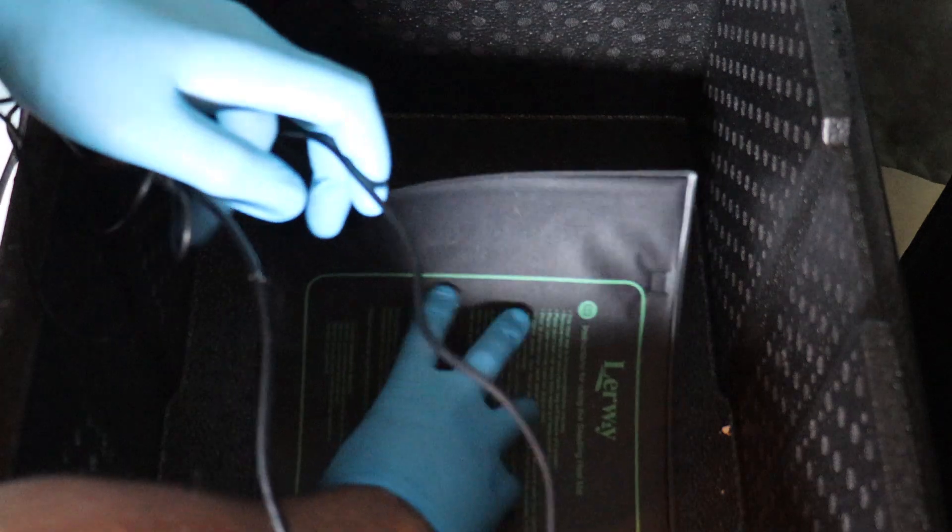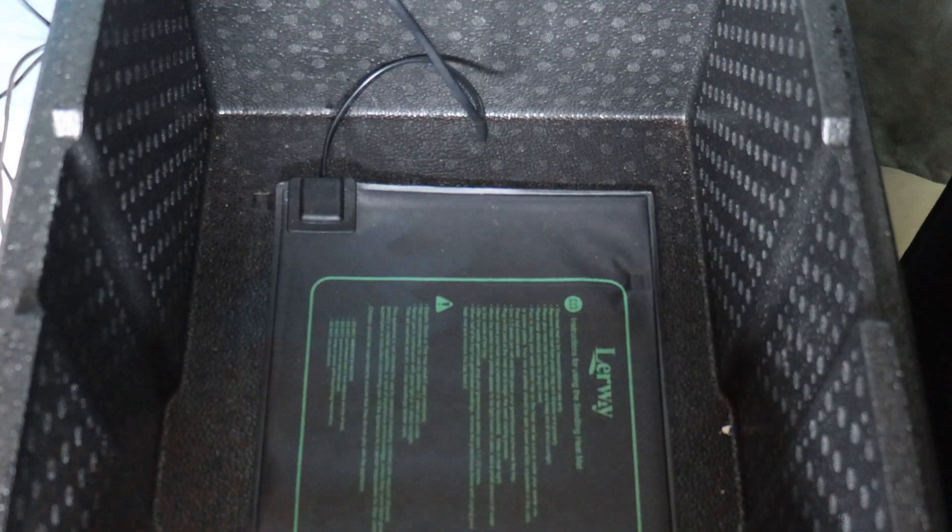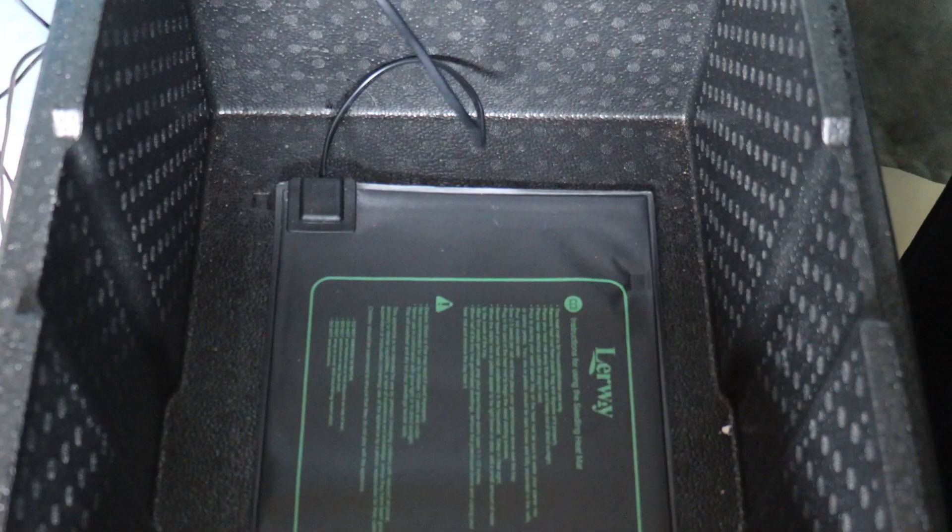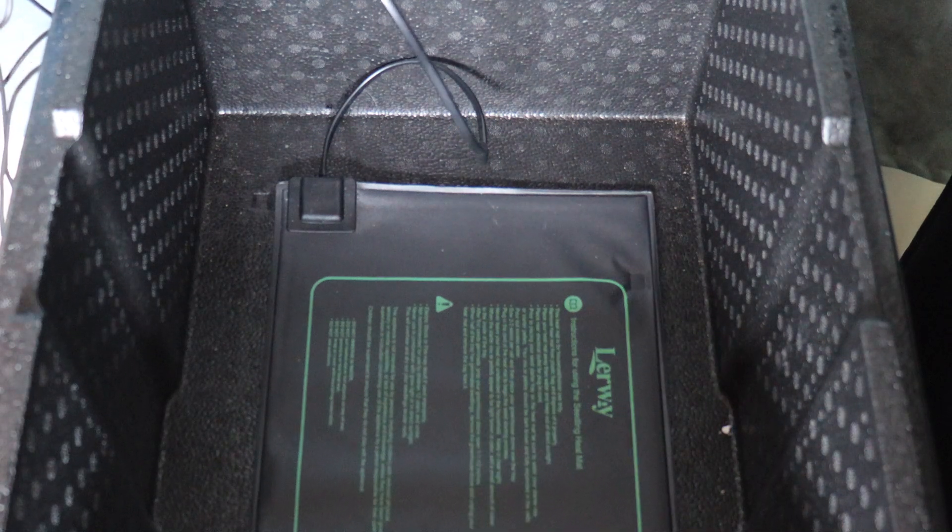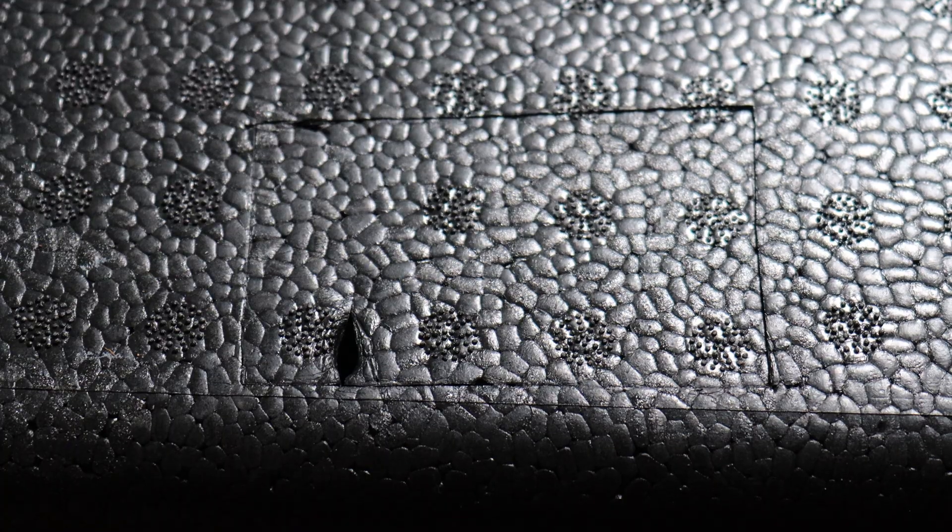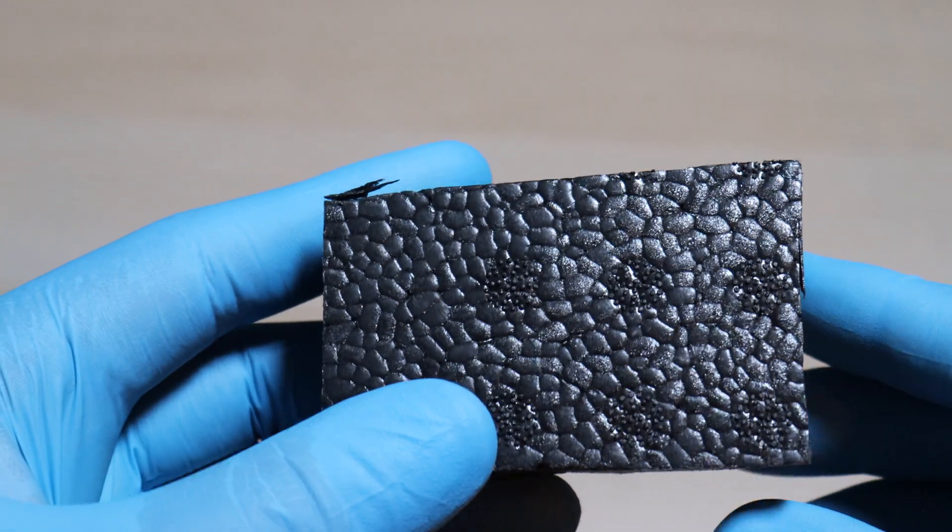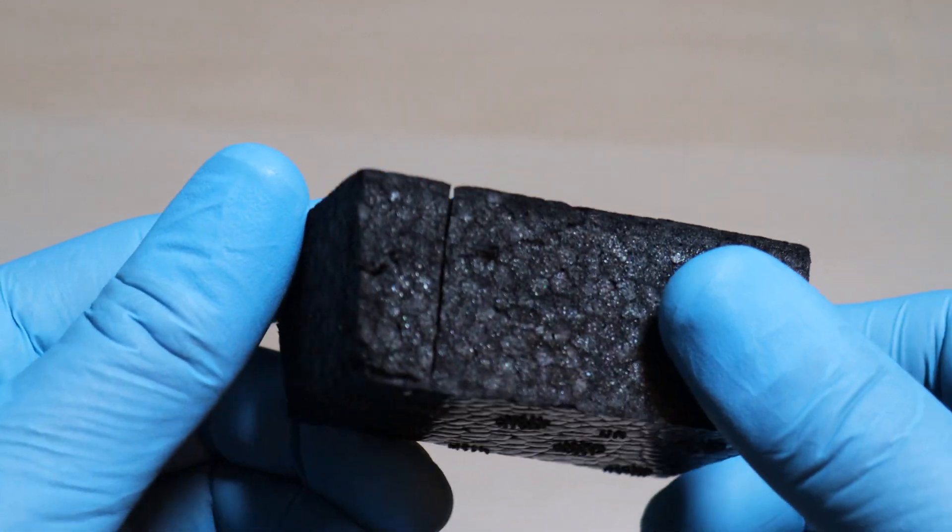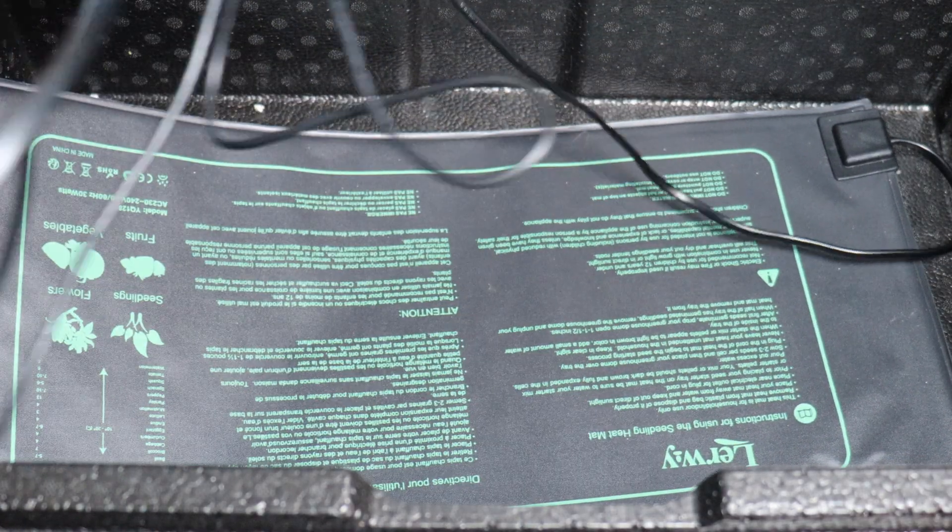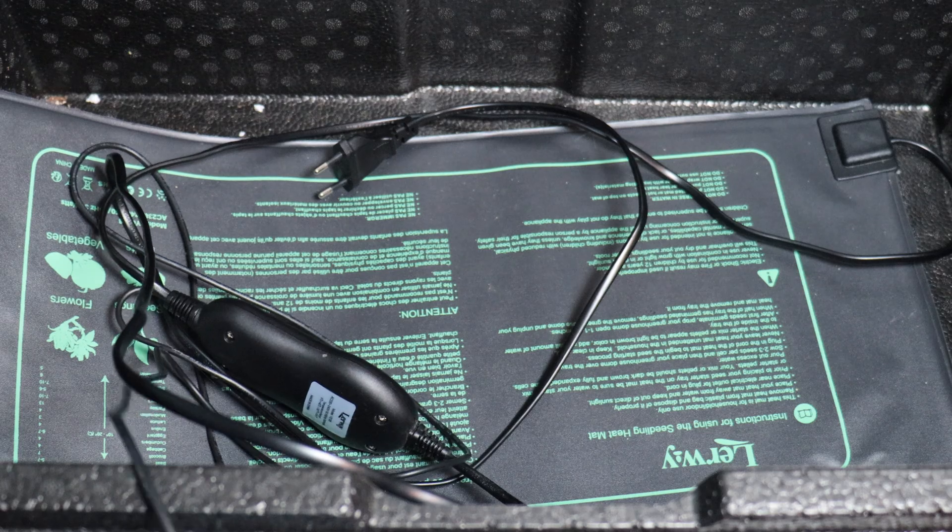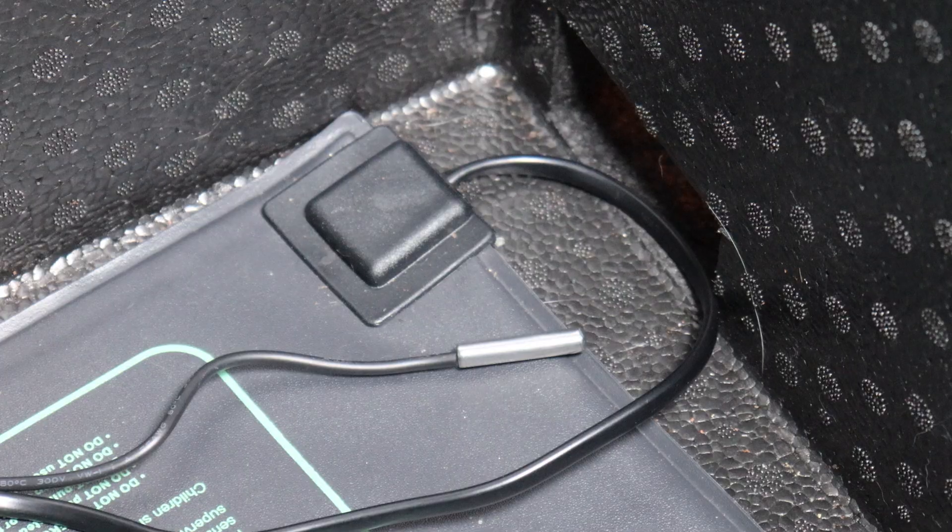All right, now it's time to assemble the incubator. I like to take the heating mat and note where the power cable is. This will inform where we make our first cut. Right there. That's where we want it. Cut a square hole and with the foam you've cut out, make a little cut like this. This is where the power cord will fit into, and then it's just a matter of putting the heating mat in and pulling through the cables.